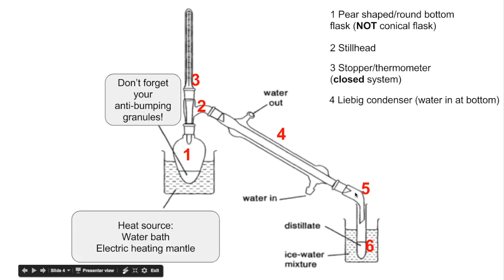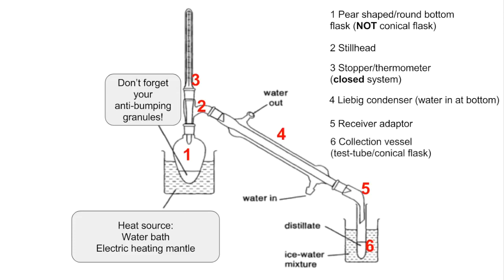Number five is the receiver adapter, which helps the liquid distillate fall into the collection vessel. Number six, the collection vessel, could be a test tube or a conical flask. You'll notice it's sitting in an ice-water mixture to make sure that volatile substances stay liquid.